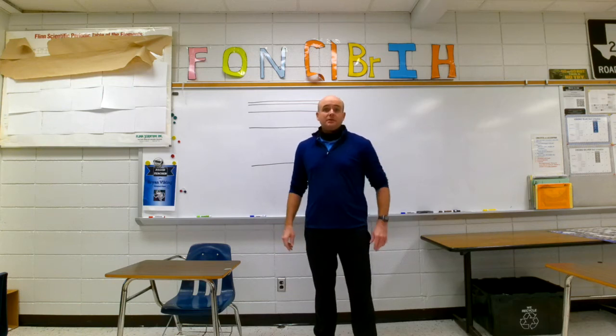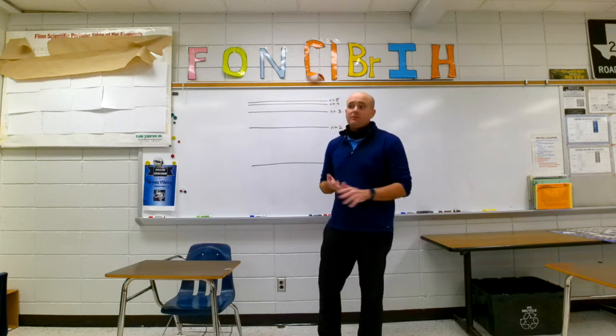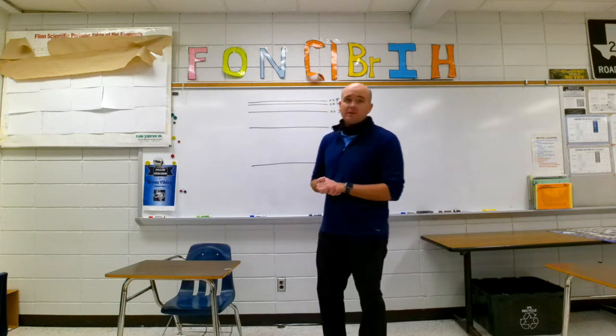Howdy, PAP chemistry students. We're going to investigate the flame test lab. And first off, we're going to do a little bit of explanation on what the Bohr model is.